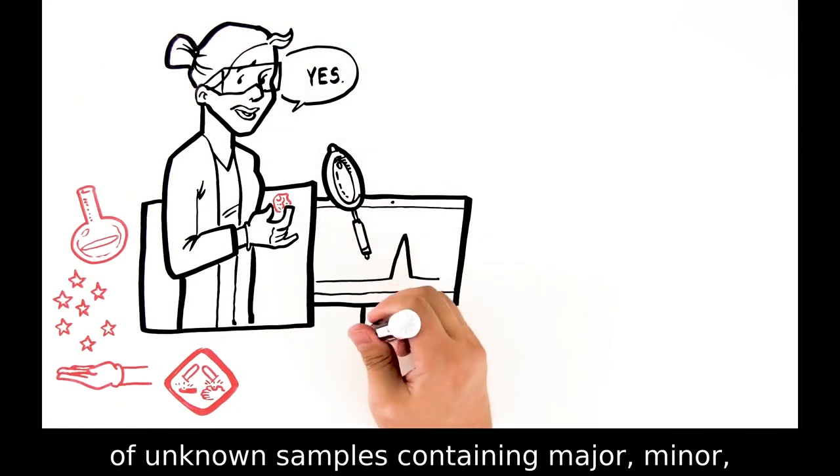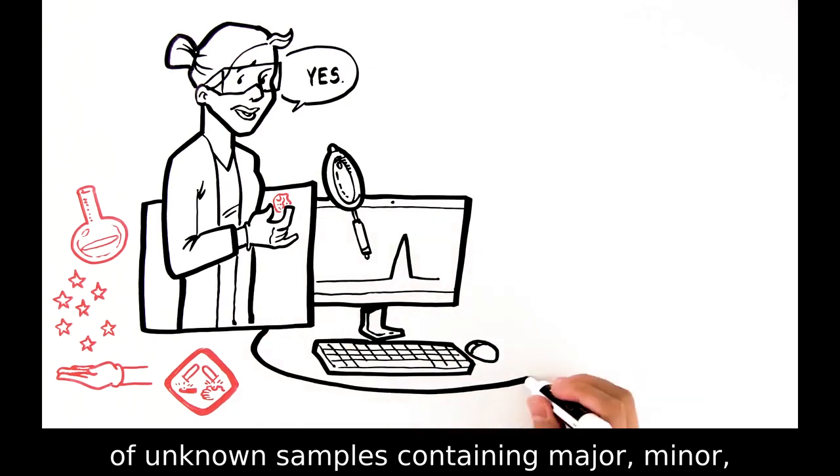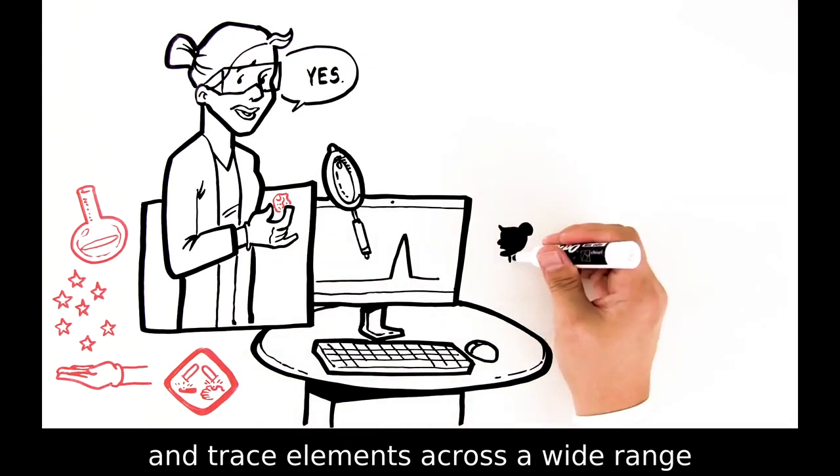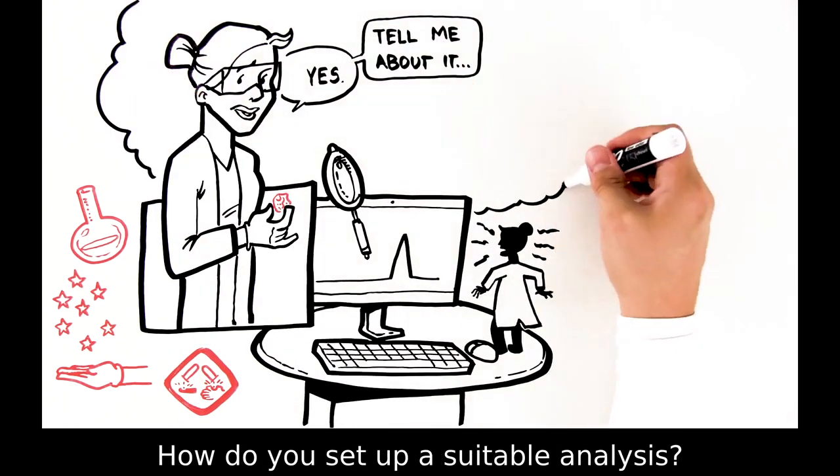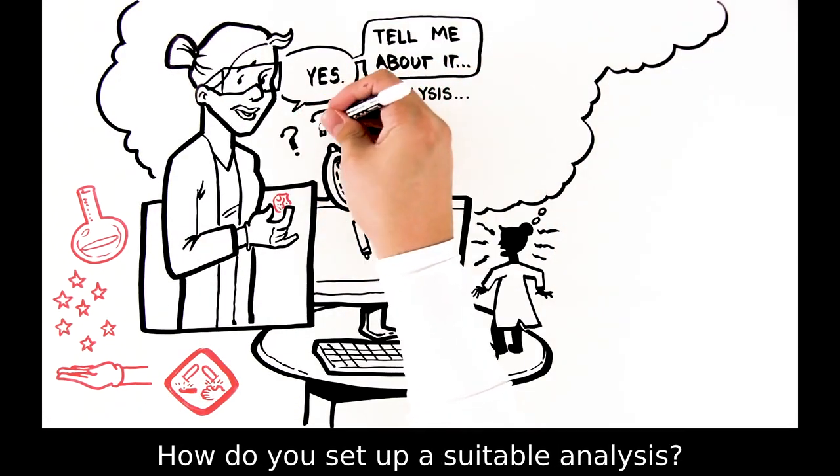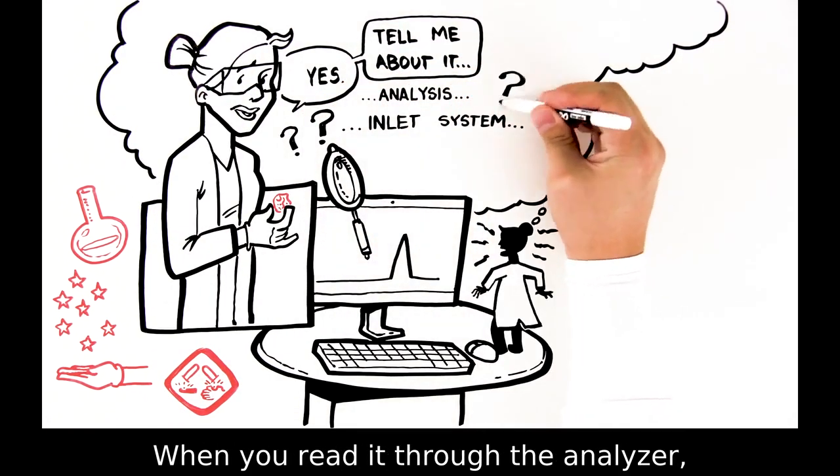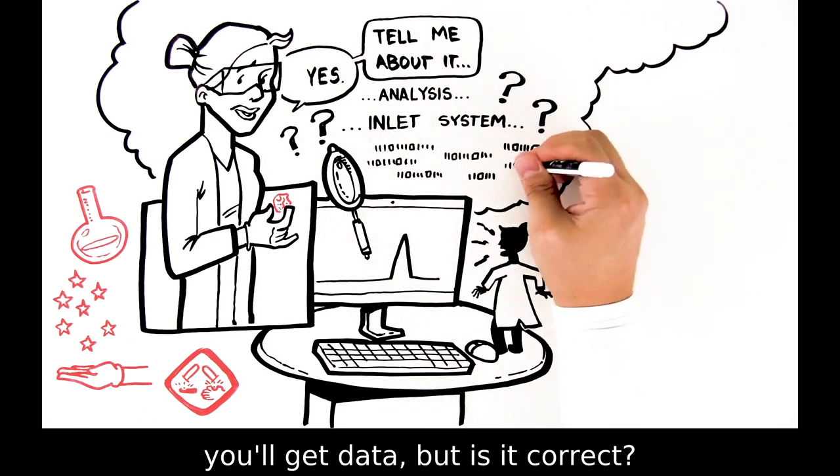Performing multi-element determination of unknown samples containing major, minor, and trace elements across a wide range of sample types can be a pretty stressful proposition. How do you set up a suitable analysis? What inlet system do you need? When you run it through the analyzer, you'll get data, but is it correct? Are there any interferences in your spectra?